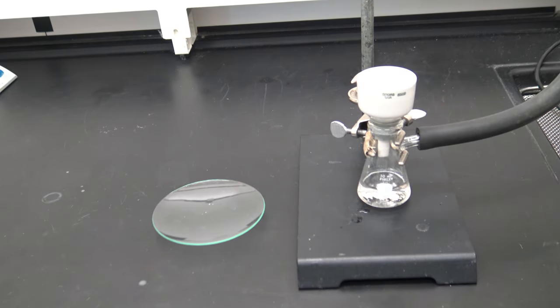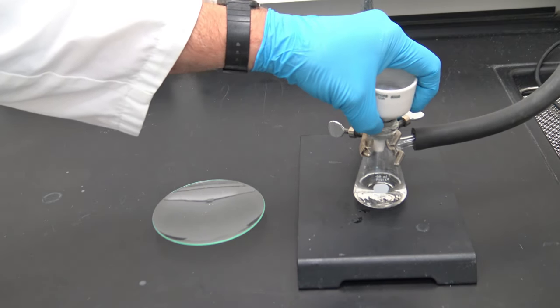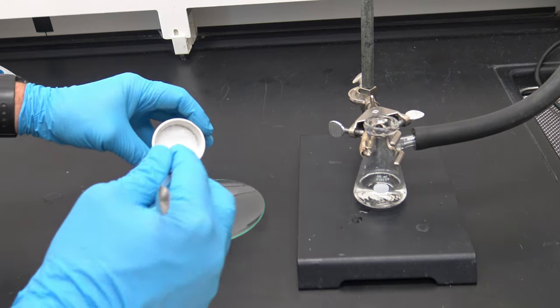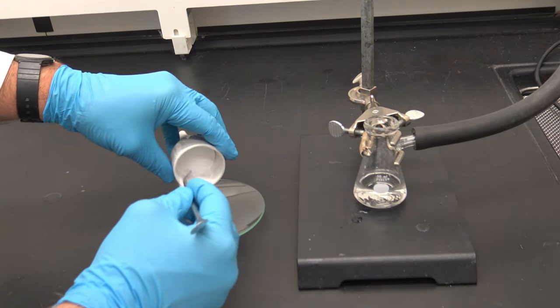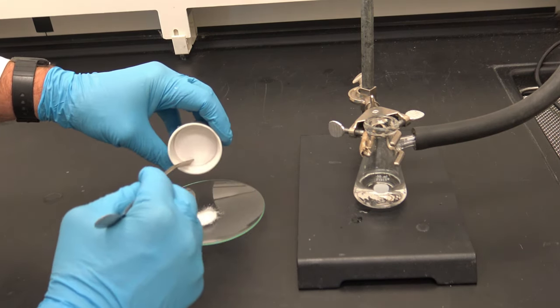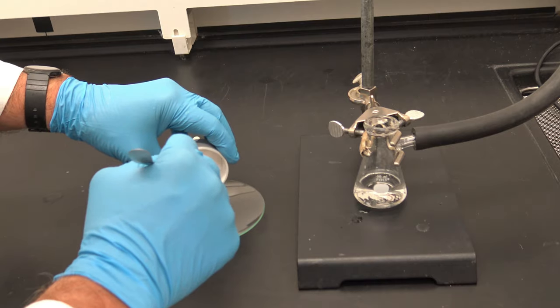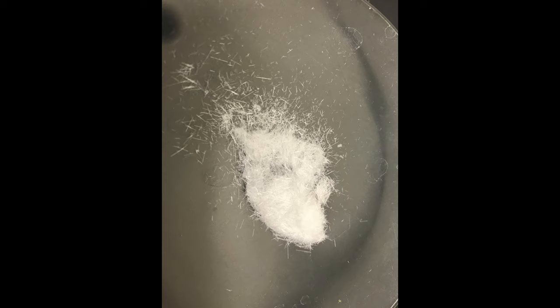It's been about 5 minutes. I'm going to turn off the vacuum, remove my Buchner funnel from my sidearm flask, and scrape my salicylic acid onto my watch glass. These crystals appear almost needle-like.